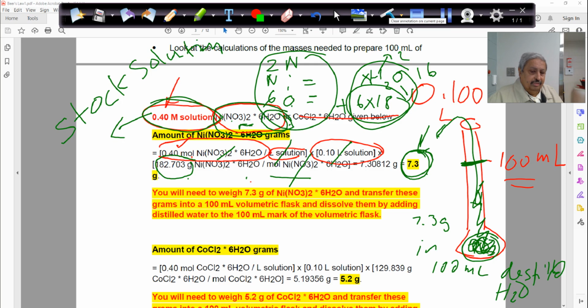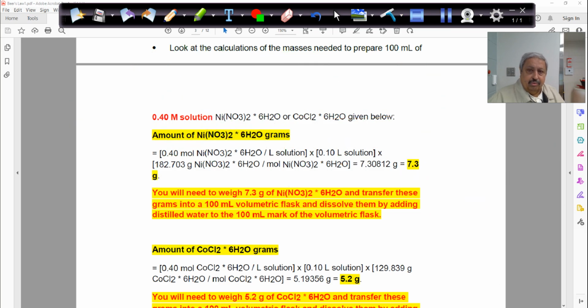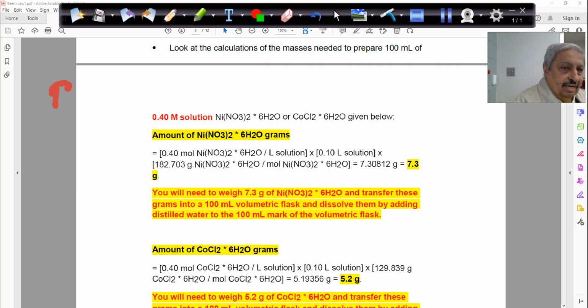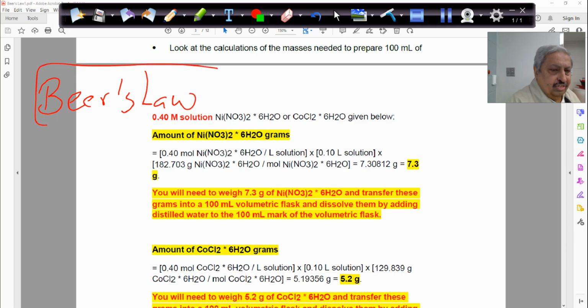So can I take some out? Now I'll come here. I will make what dilutions? The Beer's law, if you recall, just to let you know, has a tiny glitch that's not inside your procedure. I'll show you. You can get it from some textbooks. They talk about this glitch, but you get it from experience when you work with colored solutions, measuring their concentration.